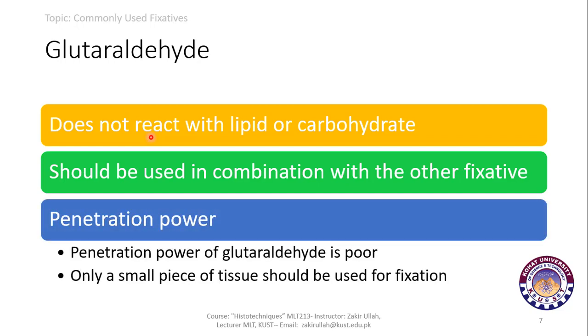The penetration power of glutaraldehyde is poor as compared to the formaldehyde, and only a small piece of the tissue should be used for fixation due to this poor power of penetration.